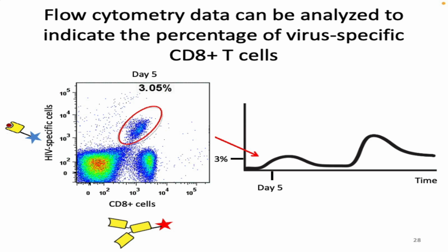So there's one more slide. And the one more slide is interesting to me in 2 ways. One, it is a modification of flow cytometry that many people use. And in fact, people are using it more and more and more and more. And even not immunologists are using it all the time now. So it's cool. It's really useful. It's also fun because it allows me to tell you a fun fact about all of this. And I really enjoy this fun fact.